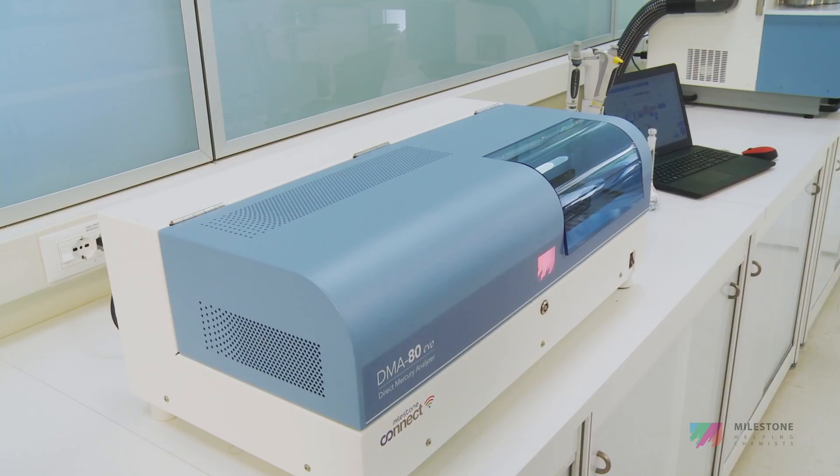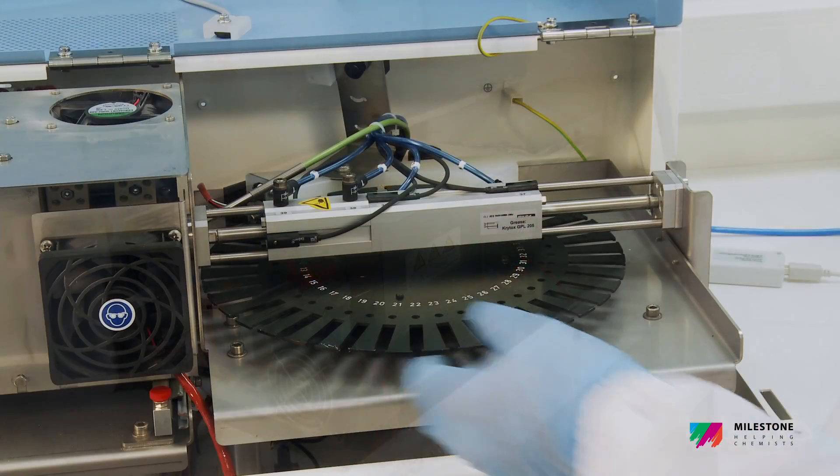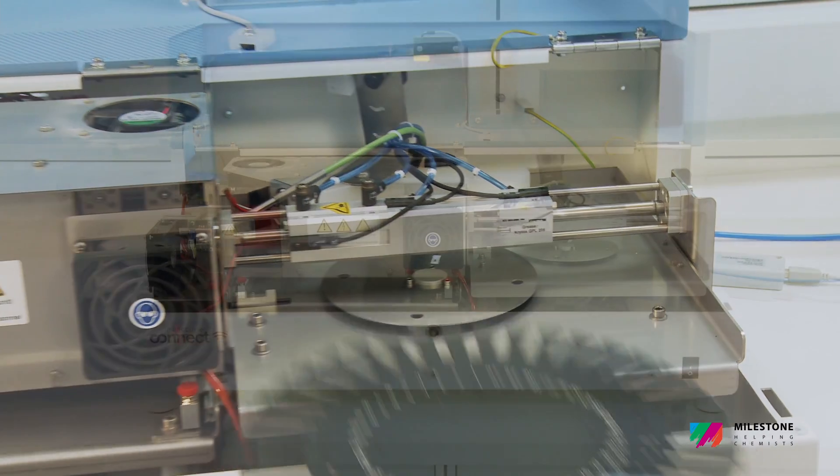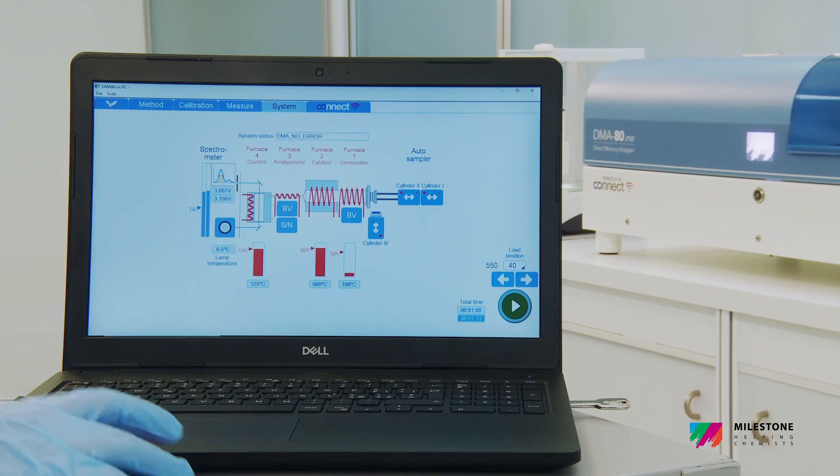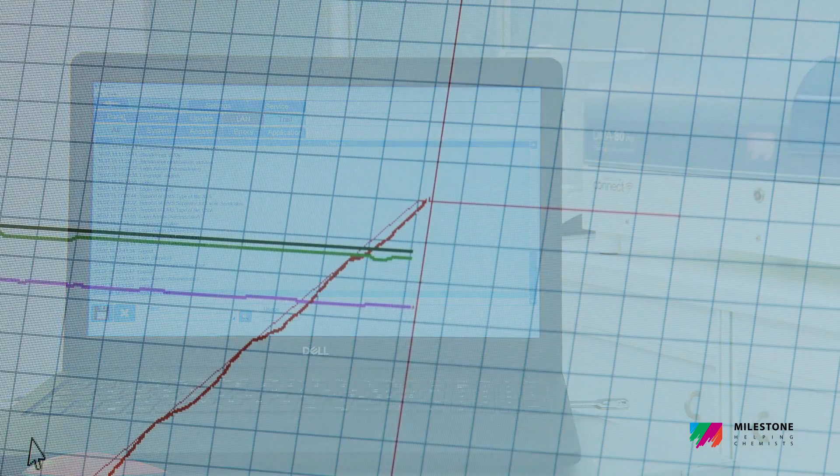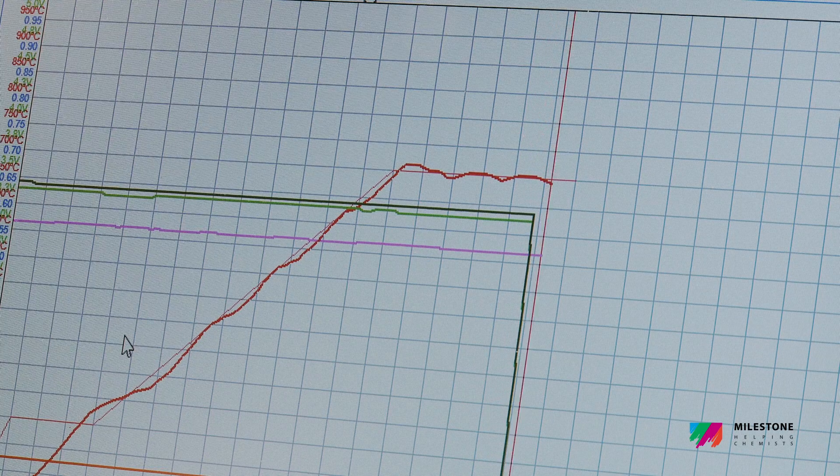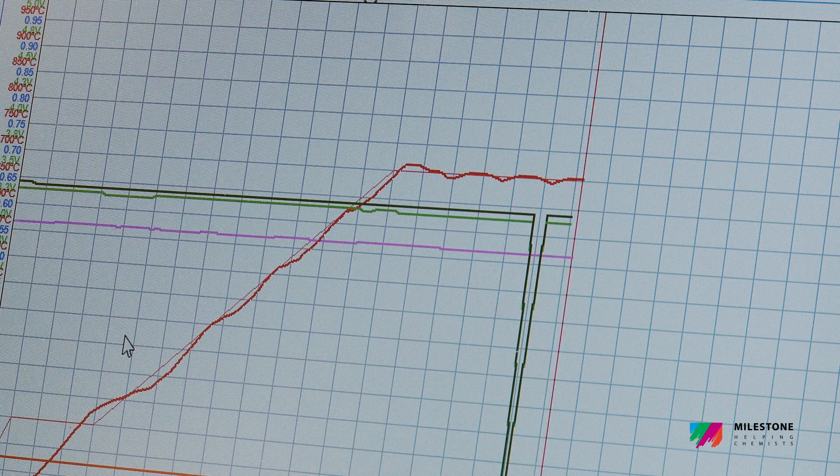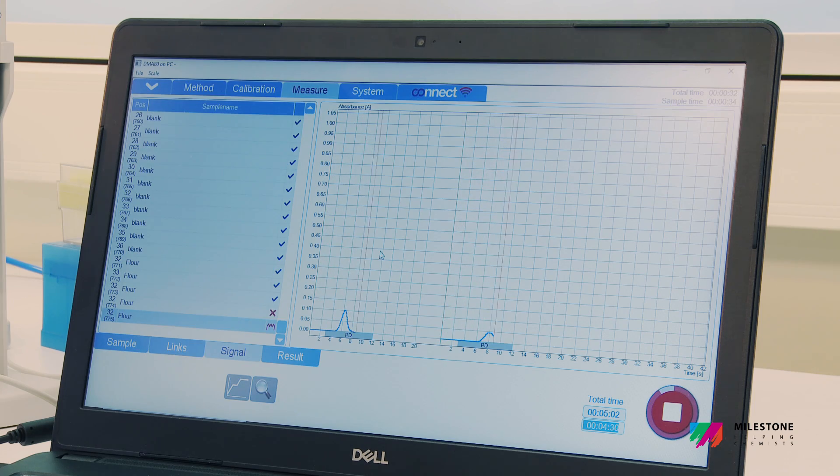The DMA80 EVO is an easy-to-maintain system, which offers low running costs. Its advanced components, such as the catalyst and amalgamator, are synonymous with reliability, ensuring the same quality over and over again. The DMA80 EVO runs perfectly with either compressed air or oxygen as a carrier, providing additional savings to the lab without compromising performance.